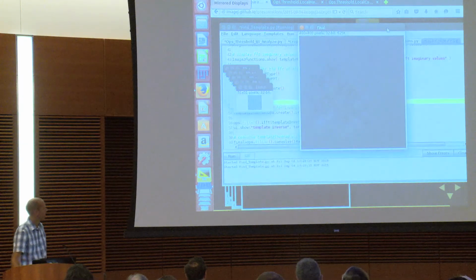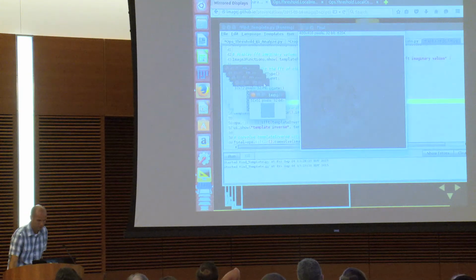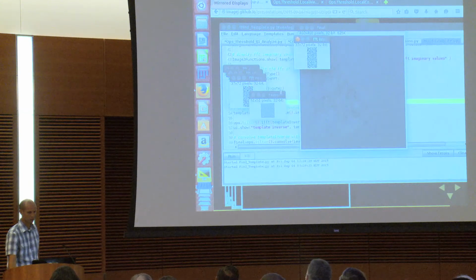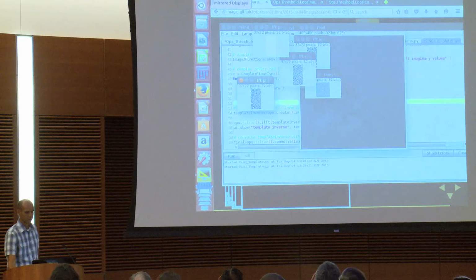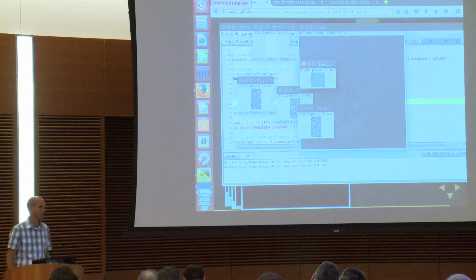So this is just a little toy example, but it tries to find a template in a bigger image. In this case, the template was cropped directly from the image, so it was pretty simple. I'm not sure how well this strategy would work on general images. But the main point of the example is just to show you a little bit about how to work with FFTs. Then you get all the different power spectrum, phase spectrum, and the imaginary numbers. So anyway, we're pretty much out of time. That's the presentation, the tutorial.